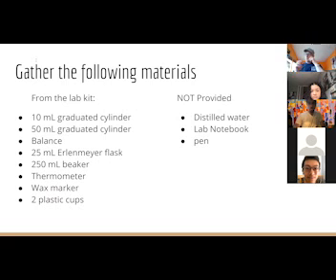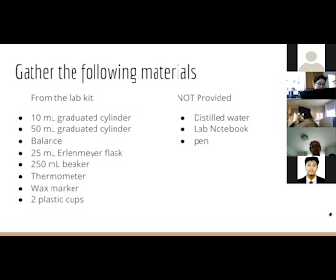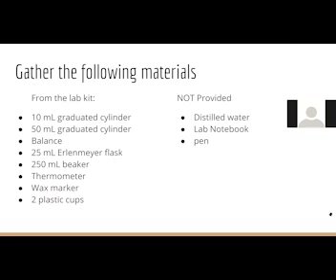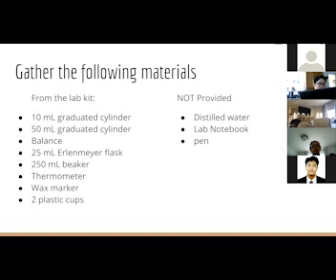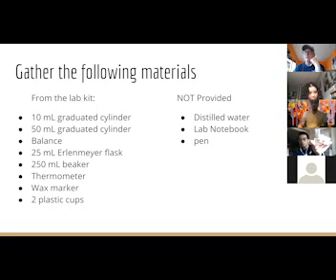All right, so hopefully we all have our kit. We have our 2 graduated cylinders. We got our balance. What's the Erlenmeyer flask? Someone hold up the Erlenmeyer flask for me. What's the Erlenmeyer flask look like? Not a lot of people with their cameras on, so I can see what you're up to. Who's got an Erlenmeyer up? Ronnie's looking for it. Professor, what is it called again? Lance, there you go. Yeah, Erlenmeyer flask.